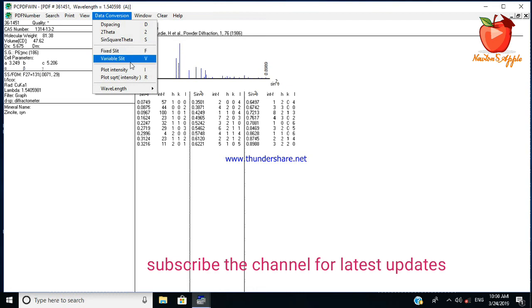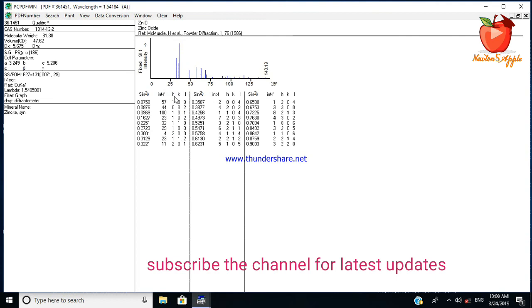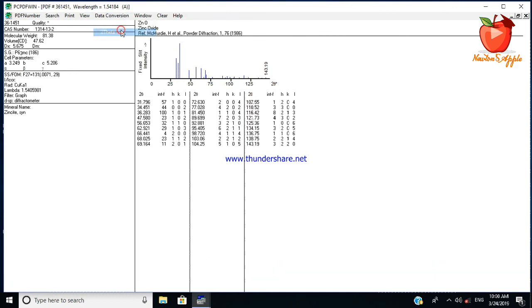You can select the desired wavelength. I selected different wavelengths and I get different two theta values for different wavelengths. There is a small change in the two theta values.